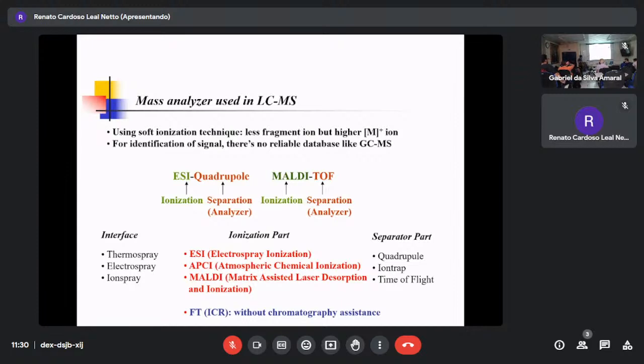How about the models? It's difficult to introduce the information of machines. MALDI, as I mentioned, is mainly for polymers. Small molecules have a little less ionization power, and they are not very well ionized by MALDI.